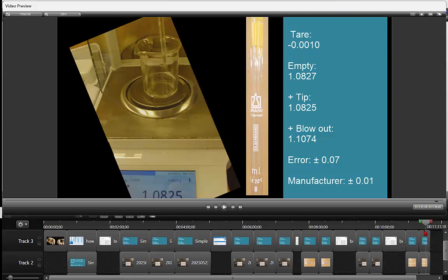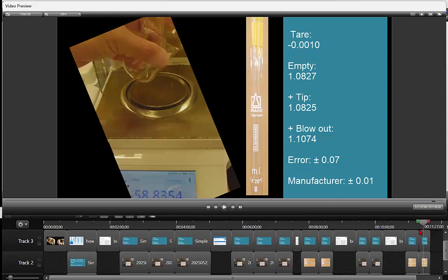So what's the moral of the story? What's the bitter red pill? You're not really going to know. Double band is meant to be blown out. Single band's meant to not be, but you're never ever really going to know.